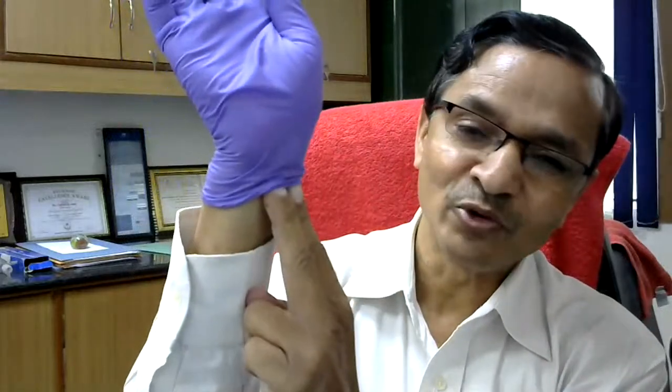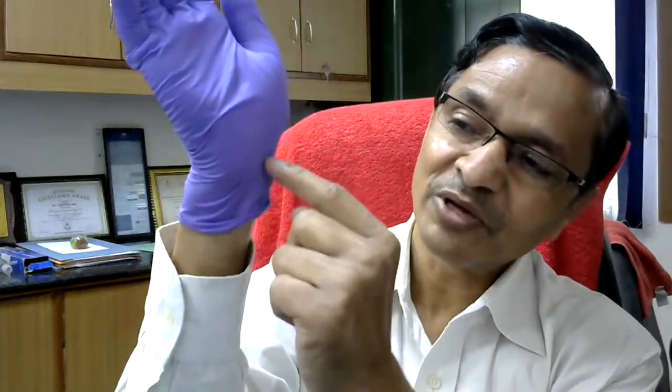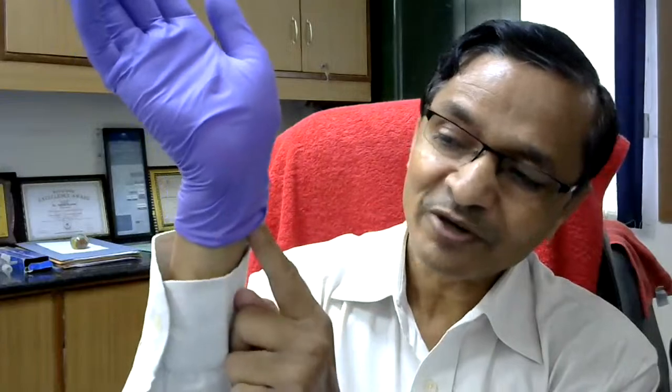Now if I remove this, then I am going to touch the ethidium bromide, because this is full of ethidium bromide. So I don't have to do again whatever I have done last time. What I will do now is go here, because ethidium bromide may be here, maybe here, but not here.